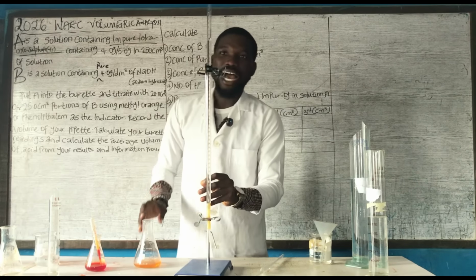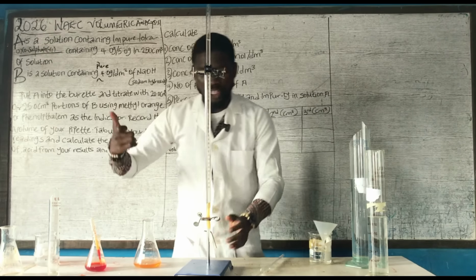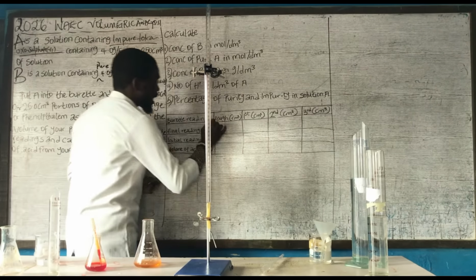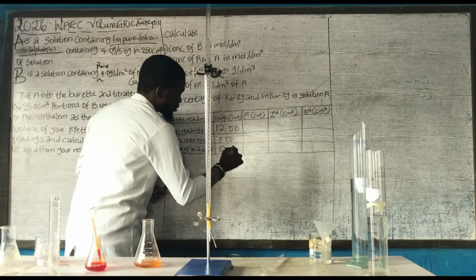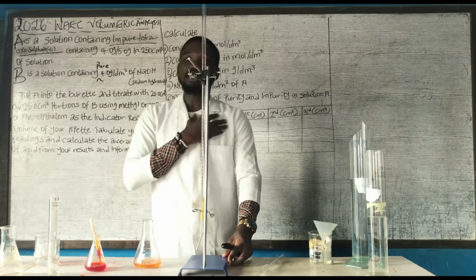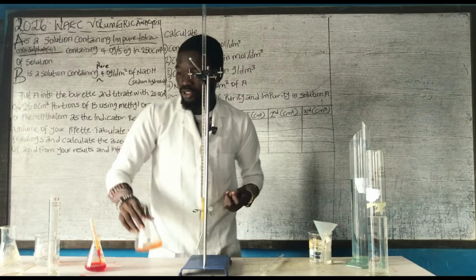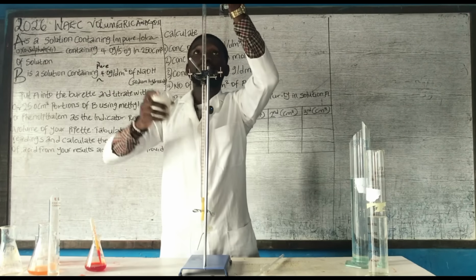Now, at this place, we are having 12. Is that clear now? If you take a look at the video I dropped yesterday about endpoints, this is how you can easily deduce your answer. Now, for the next one, you refill your burettes.